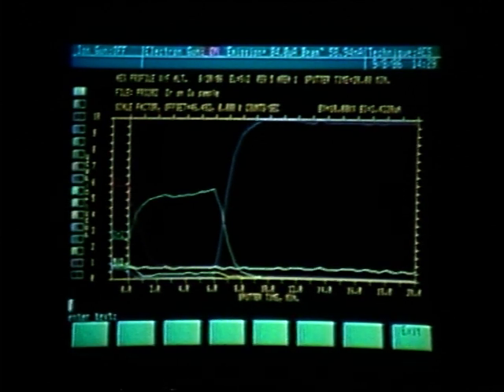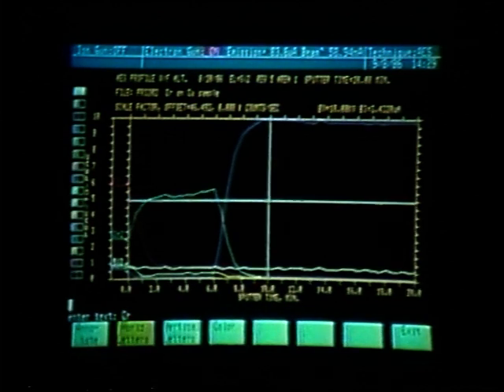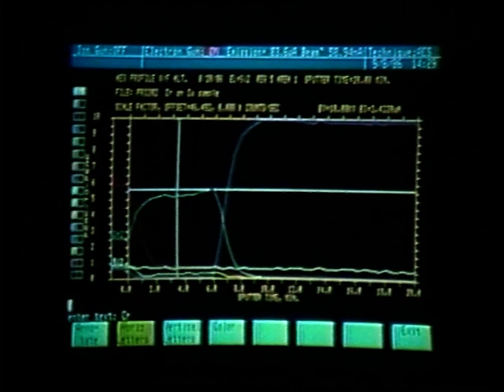Again, we are obtaining this copy in black and white, so we want to label the peaks so that we do not become confused. This is our chromium peak.